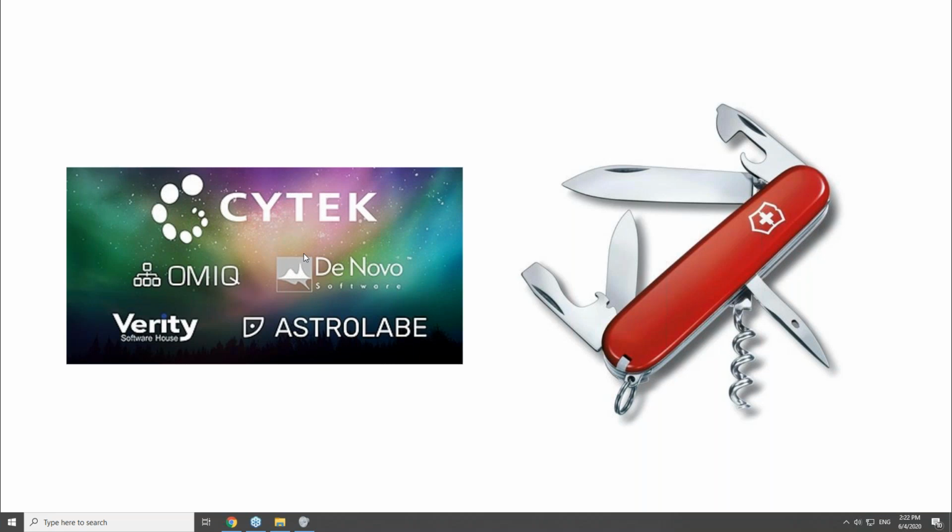The cool thing about OMIQ and FCS Express and GemStone is that they give you a wide suite of tools that you can apply to your data. So if you know what you want to achieve, and if you know how to get there, then these are fantastic tools, and I strongly recommend all of them.